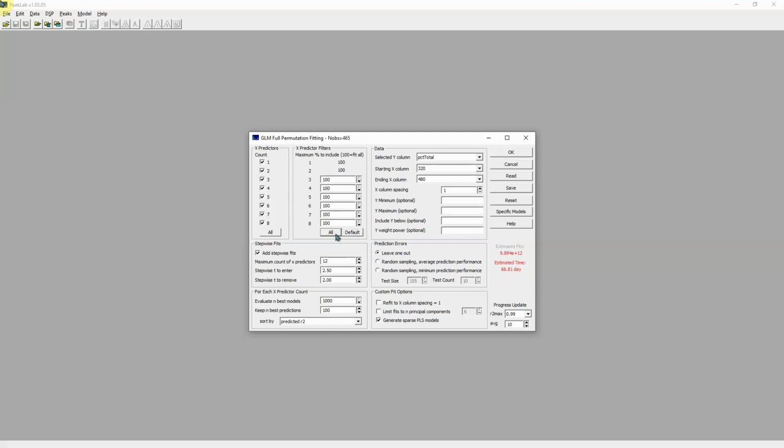The resolution in the spectroscopy does not support a 1 nanometer spacing, nor will the signal to noise in these data. We don't want to fit any systematic noise in the data, only the deterministic or spectral signal data. Now, this issue isn't specific to the PeakLab algorithm. It's also everywhere a problem with forward, backward, stepwise multivariate regression when you're in statistical modeling.